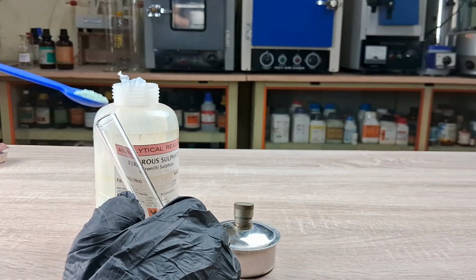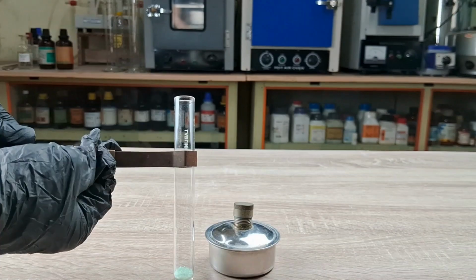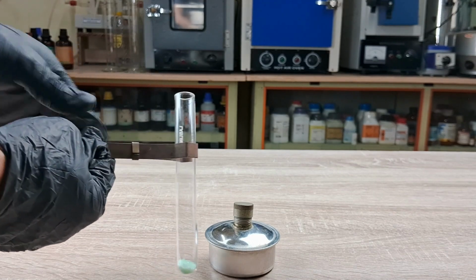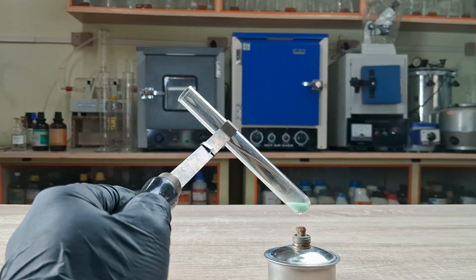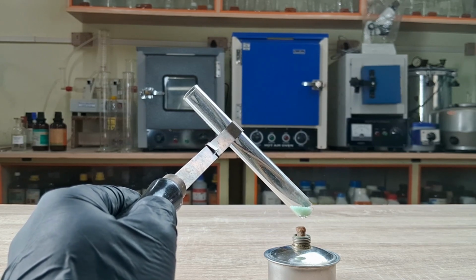To perform this experiment, take a small amount of dry ferrous sulfate crystals in a test tube. Note that the color of the salt is light green. Now, while holding the test tube safely using a test tube holder, begin heating the bottom of the tube on the flame of a spirit lamp or a Bunsen burner. Continue heating the tube for several minutes. Record your observations.